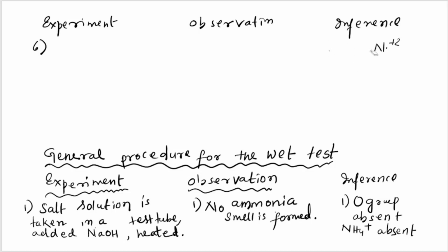After the borax bead test you will proceed to the general procedure for the wet test. You know, in the wet test, how many groups are there?